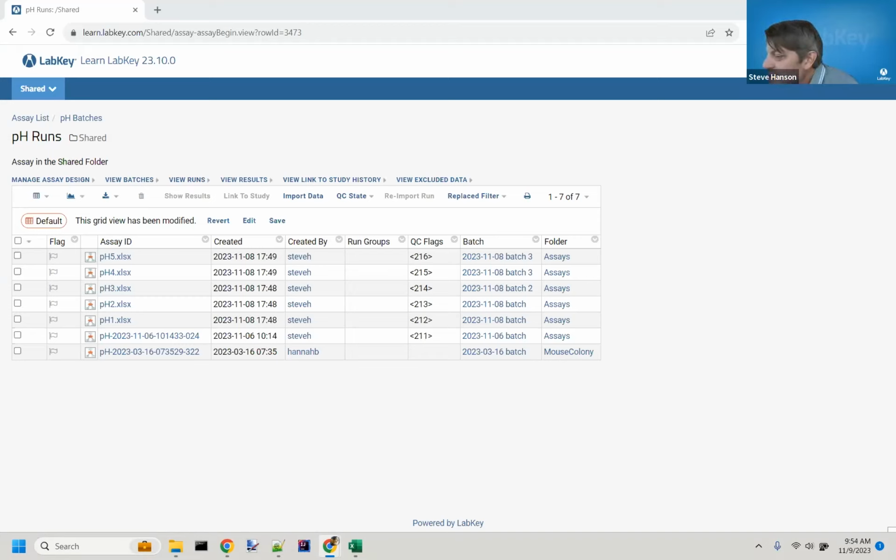Another user says, sorry about that: what if the user forgets to mention the values in the run field and accidentally includes the values in the Excel file and directly imports them to results? Will the values be captured in the run fields automatically? The answer is no.